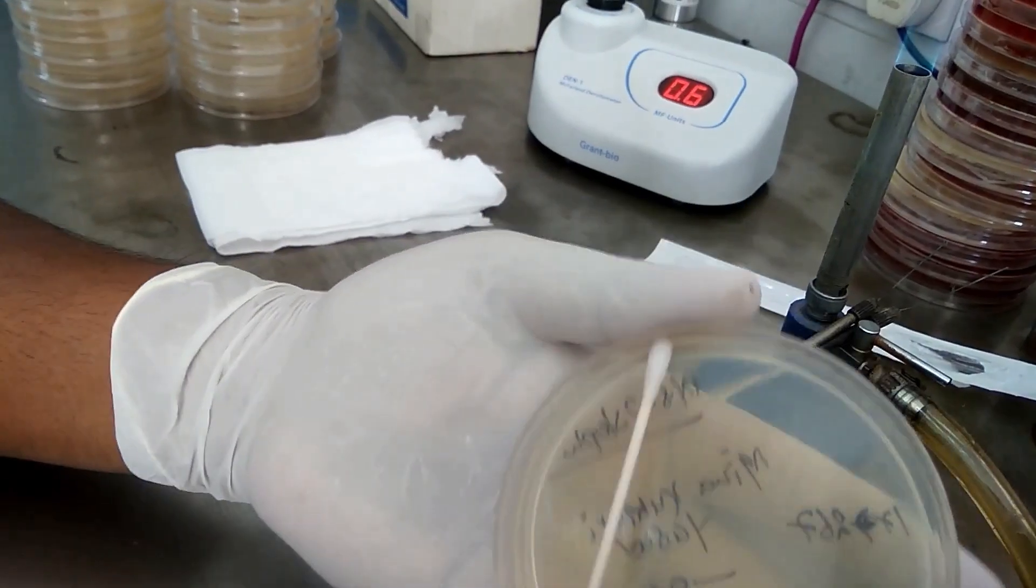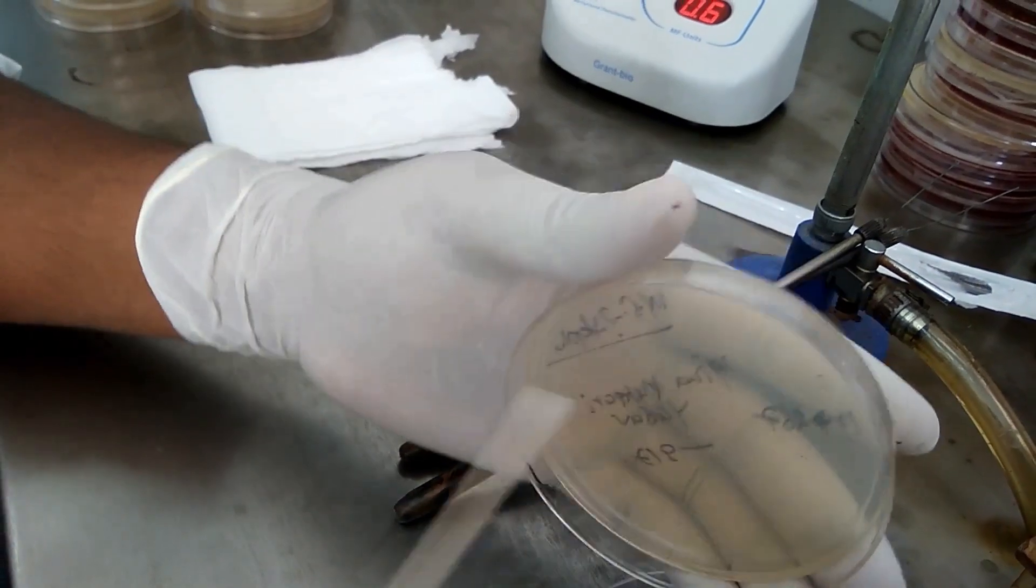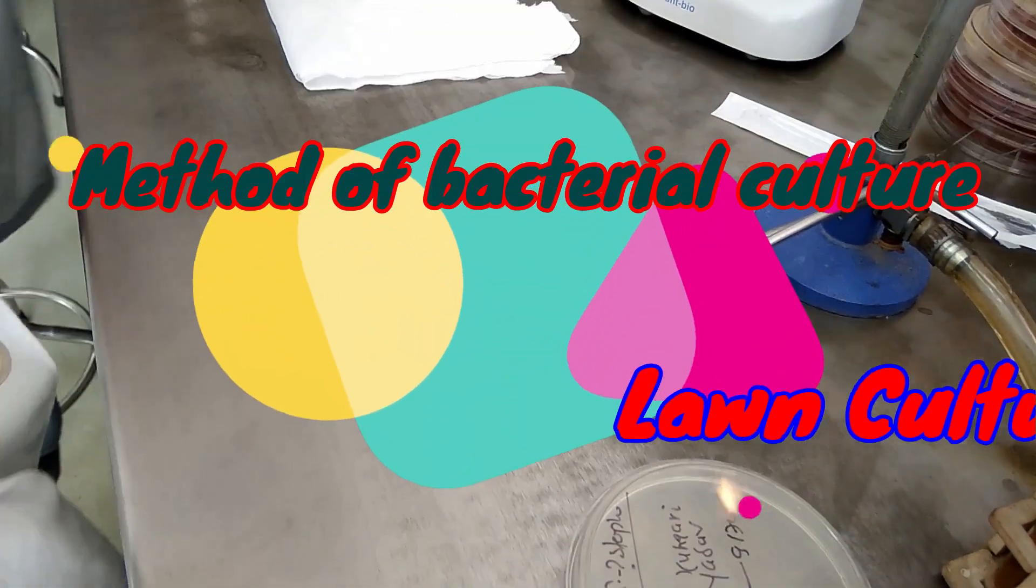Alternatively, the culture plate may be inoculated by a sterile swab soaked in a liquid bacterial culture or suspension.